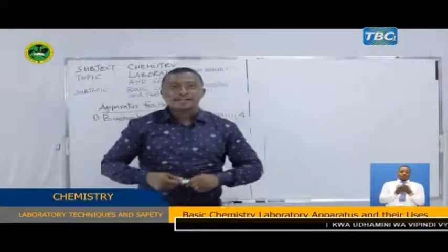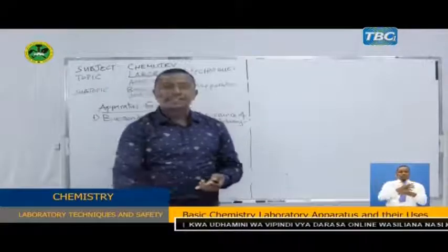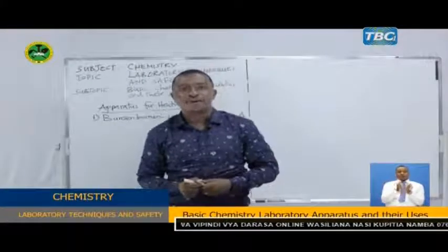So a Bunsen burner is used as a source of heat in the laboratory. Let us see another apparatus for heating.